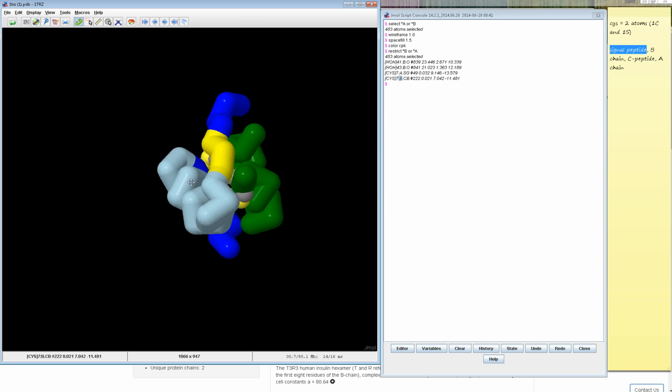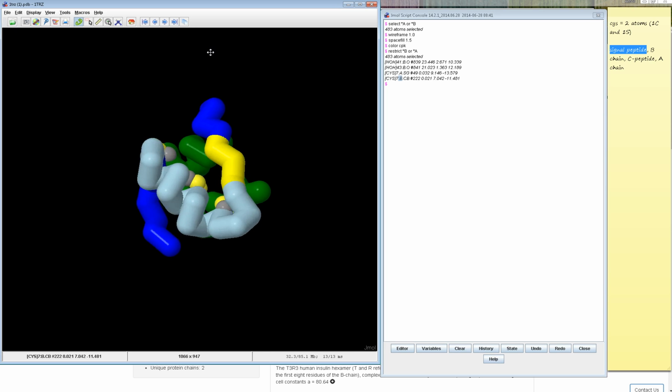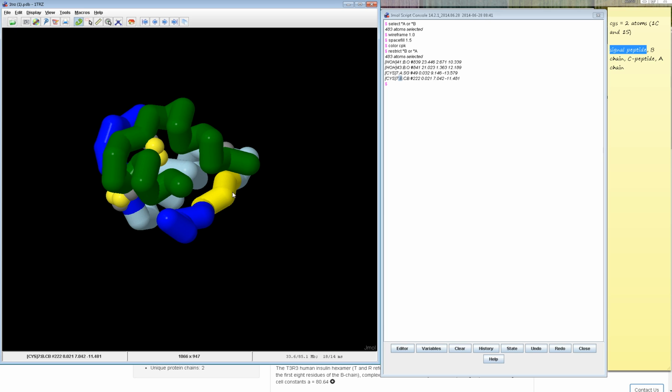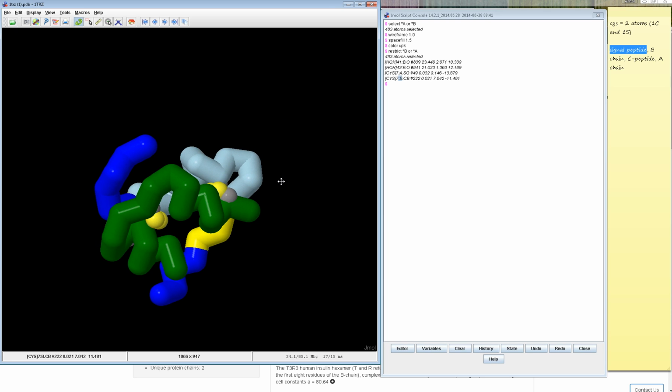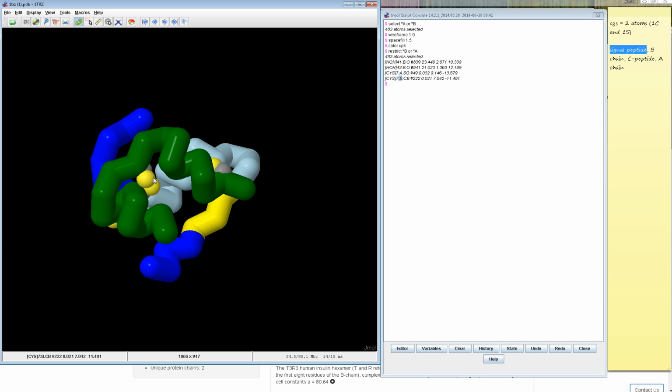This file is printable, but the color is not going to print out. So it's important that you color code this the way you want. If you make a mistake, you can change it.